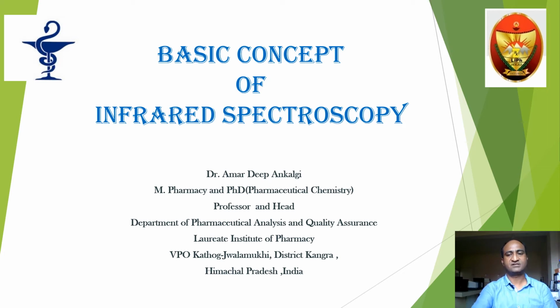Dear students, in today's lecture session, I am going to explain the basic concept of infrared spectroscopy. Before handling the FTIR instrument, one should have some knowledge regarding the principle and instrumentation of FTIR, as well as sample handling while using the FTIR.